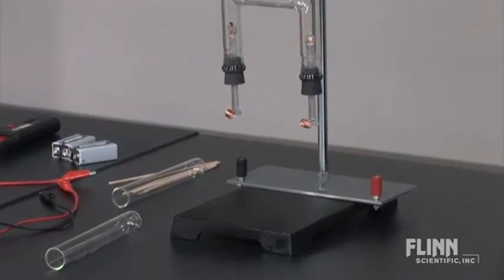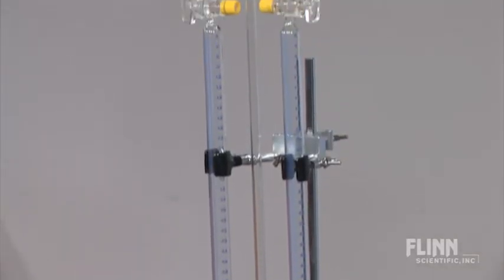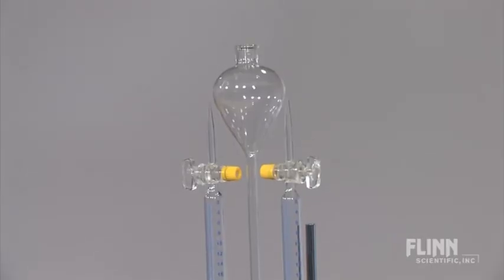The Hoffman demonstration apparatus is easy to set up and is calibrated for precise measurements. It has its own rugged ringstand base, a built-in thistle for easy filling, and stop cocks for easy removal of the gases generated.